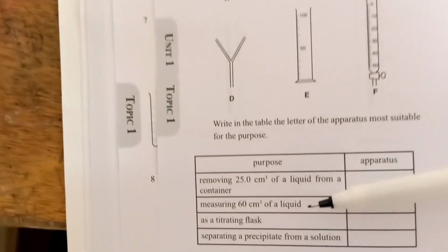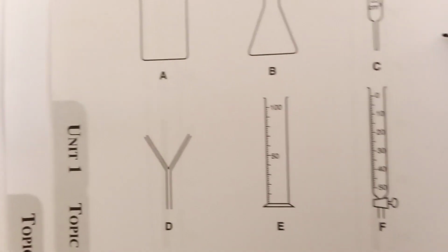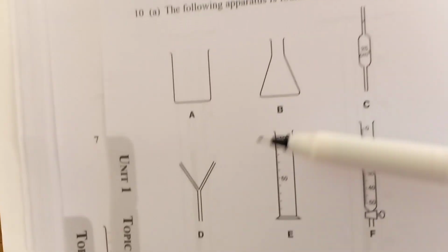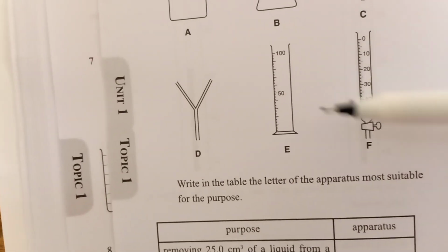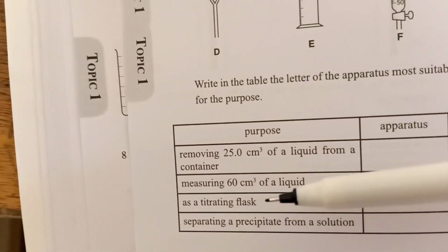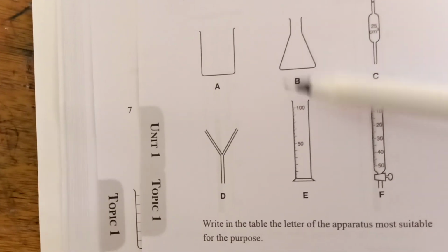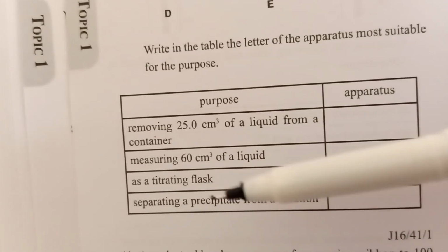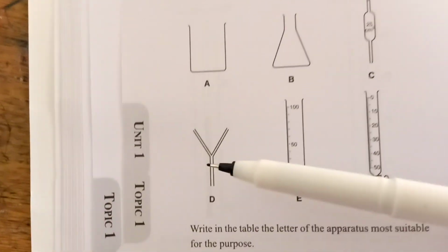Measuring 60 centimeter cube of liquid, we cannot use the burette; we use E, the measuring cylinder. So you put letter E here. A titration flask is B, a conical flask. Separating a precipitate from a solution, we use D, filter paper and funnel.